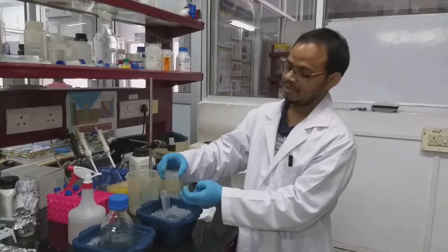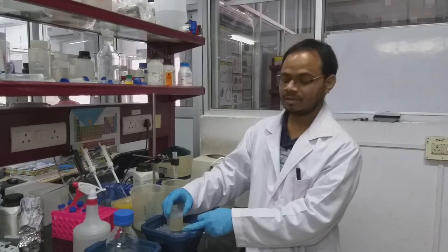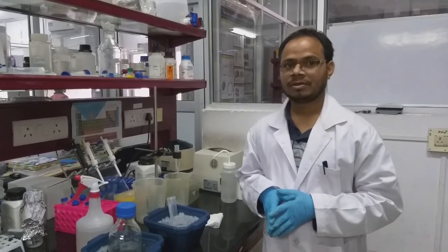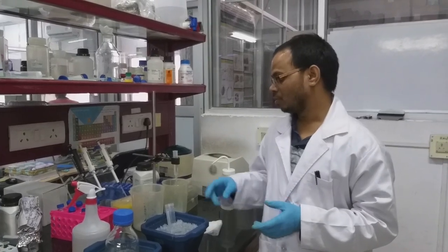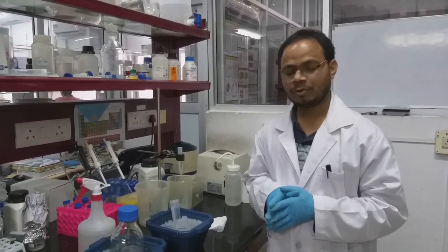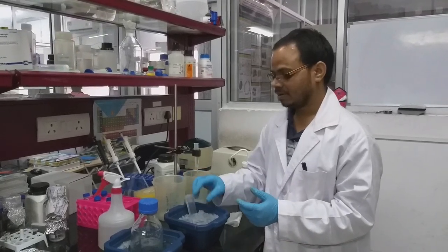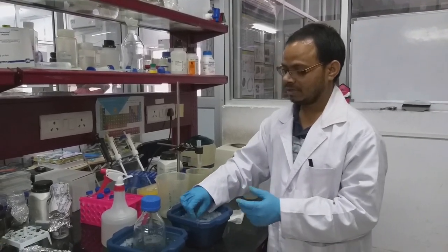We have lysed the cells using sonication. Now we have to centrifuge the lysate to get the supernatant. That supernatant we load onto the nickel NTA column and purify the protein. So I will transfer it into a 50 ml centrifuge tube, then I will centrifuge.